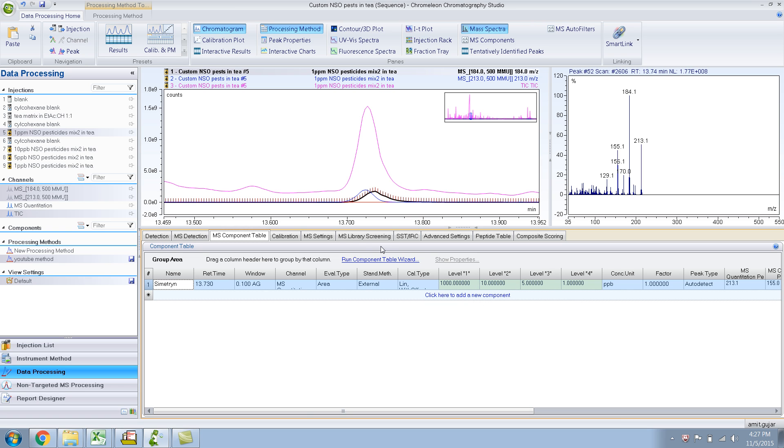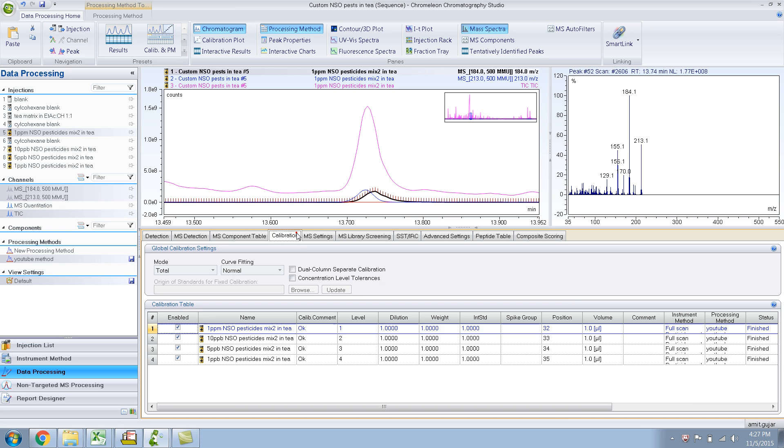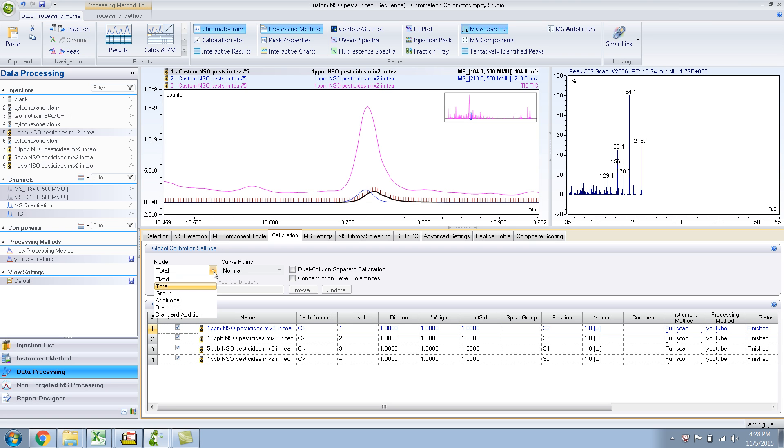Right now the mode over here is total. There are other settings. Say your calibration is not in this sequence, it's in some other sequence, that could very well be possible.